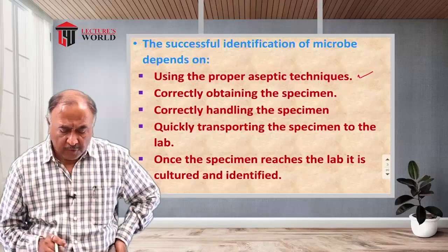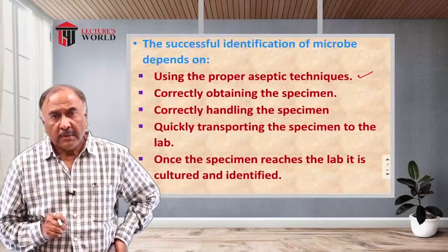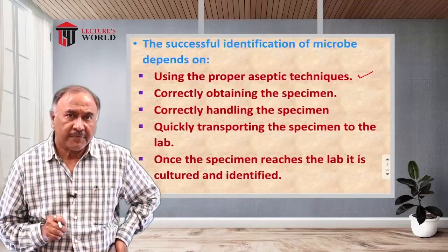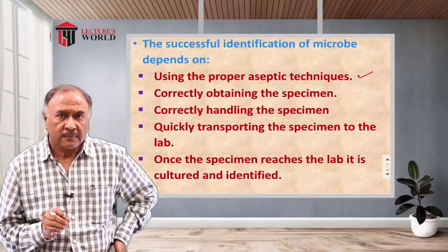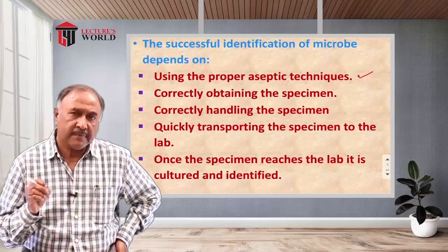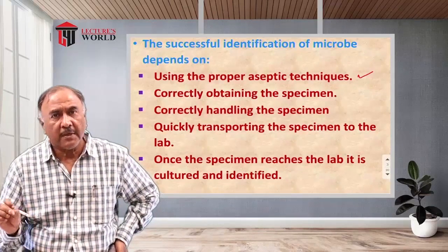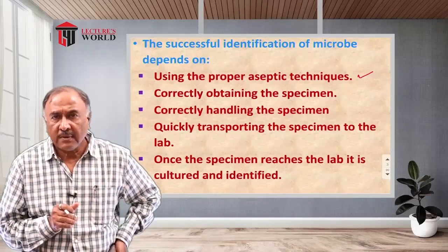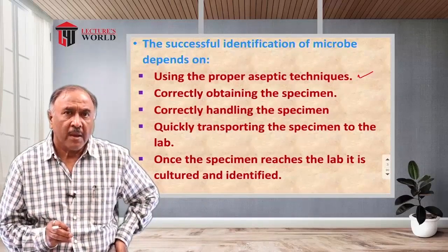First, the use of proper aseptic technique. The sample which is collected from a patient has to be collected under proper aseptic conditions. Why is this given such huge importance?